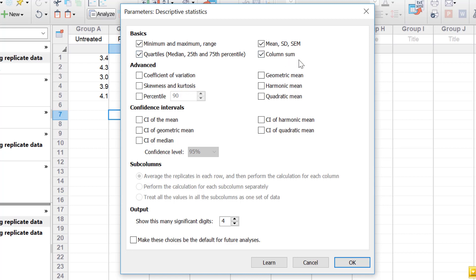There's also the column sum, where GraphPad adds up all of the data points within each column and gives you an overall value. Under the advanced subheader, there's the coefficient of variation, which is a ratio of the standard deviation to the mean. It's often presented as a percentage, indicating how variable the data is.